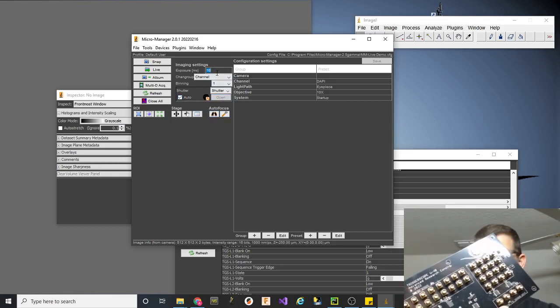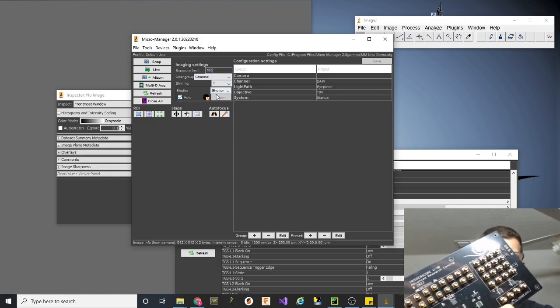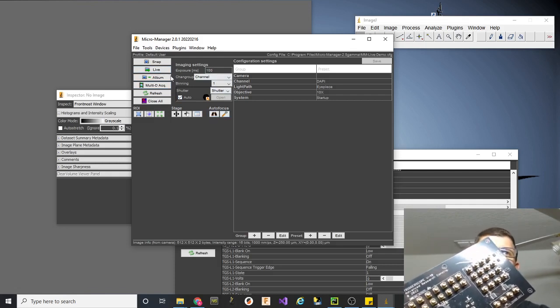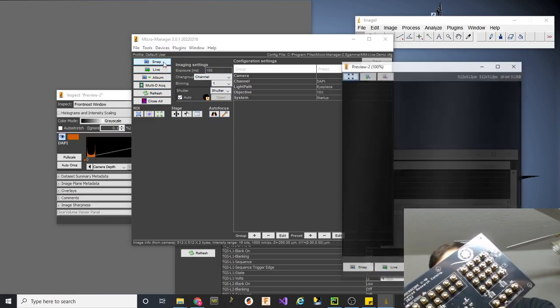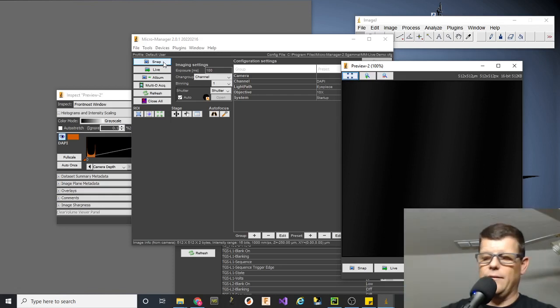Now if I set this guy here up to about 100 milliseconds so we can clearly see it, we should be able to auto shutter and see that the current TTL output is going to turn on when we snap an image and then turn off when the snap is finished. And it did. So the shutter control is working properly.